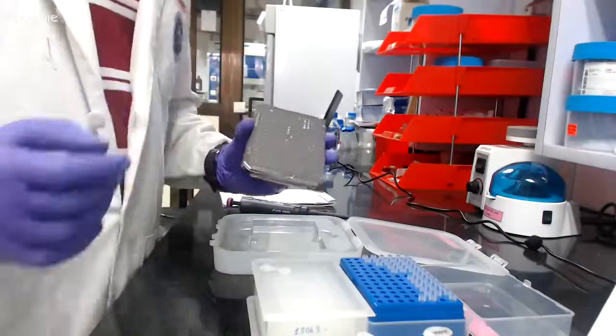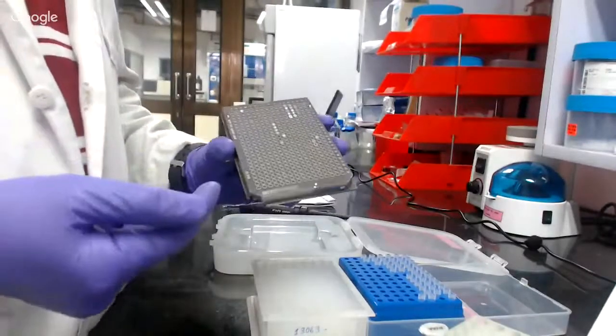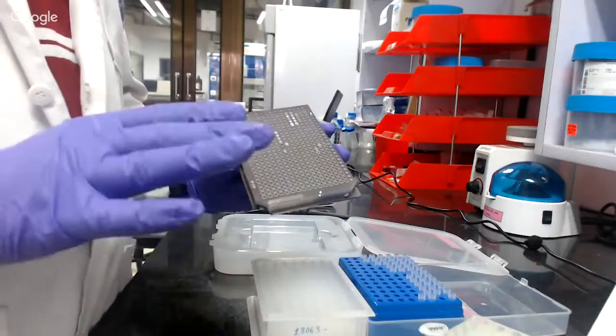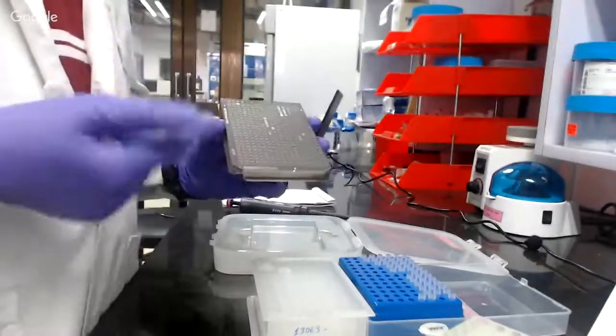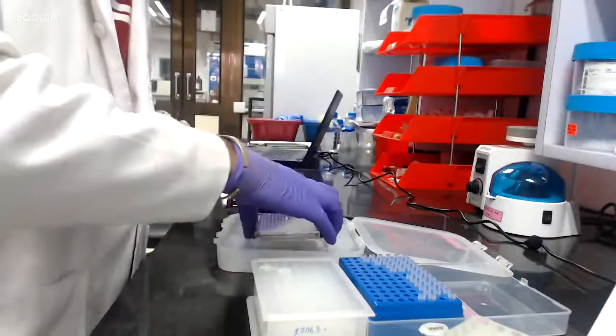Yeah, hello. So basically, this is a MALDI target plate, which is a ground steel plate, and it has 384 wells, where we can spot 380 spots of the samples at a time. So it is very fast. We can analyze all samples at one time. So here I am going to show how to spot the sample.